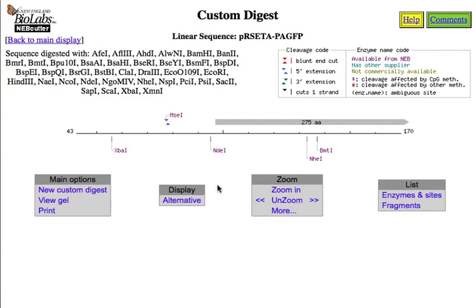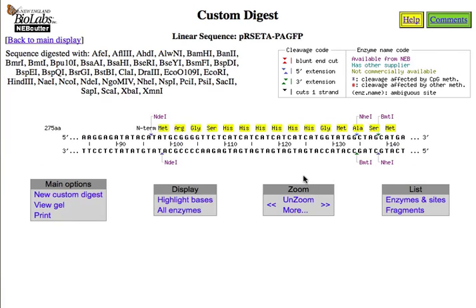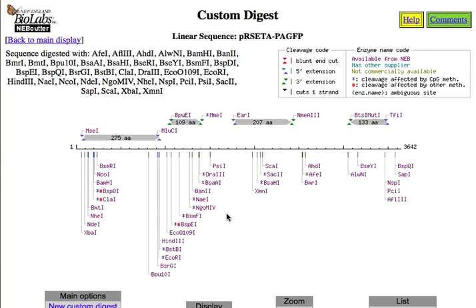But that's another way to find these enzymes, the NHE1. So it's cutting in. It would probably be okay. But notice we're about 10 or so amino acids into the protein. So I'd be worried that we would start interfering with the function of the protein. But I would probably in real life give that one a try in the lab. But our choice today is the BSRG1 site right here that's at the C terminus.